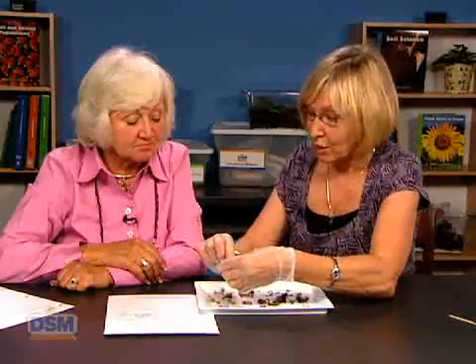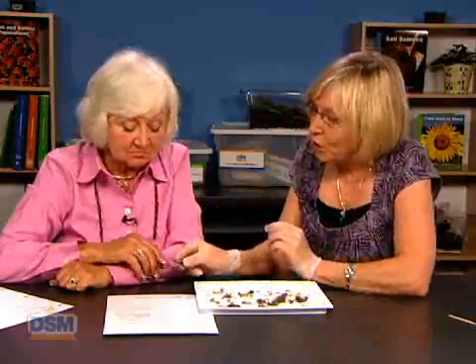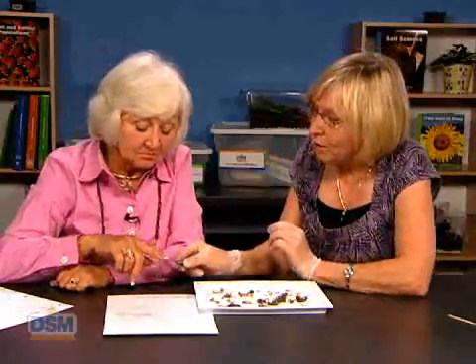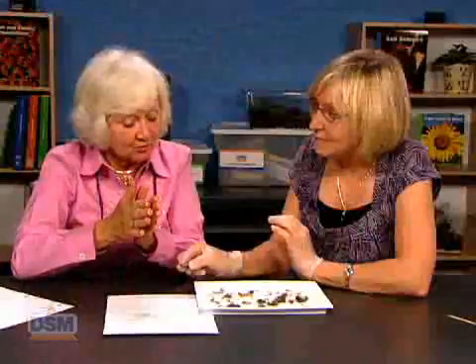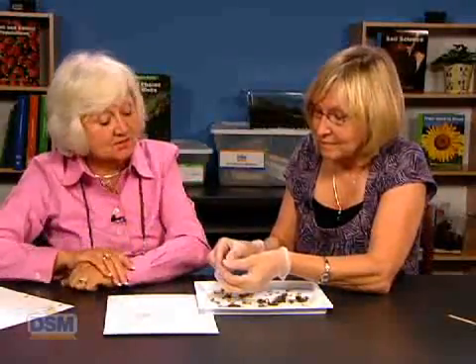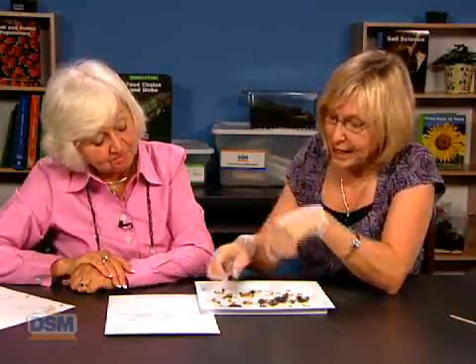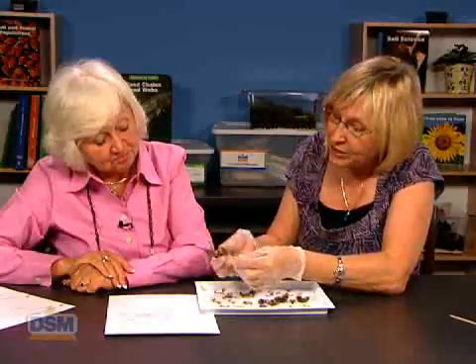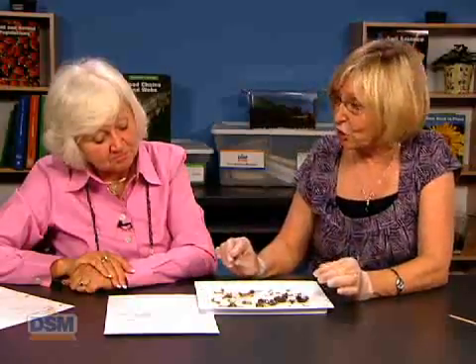So what we can do too is, when we further take it apart, we have the bottom jaw. If you look very carefully on that, you'll see that there are little teeth on that bottom jaw, and actually you'll find 2 of these because the bottom jaw is only held together with a little bit of cartilage, and it breaks apart. Right. They can use their magnifiers and get a closer look at the teeth. And with this one, obviously the other jaw has gotten knocked off. But as they're taking those apart, they probably will find some skulls that are totally intact, so that they'll be able to see that the jaw was attached.